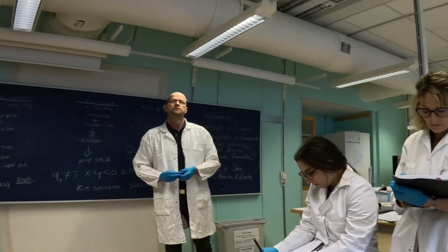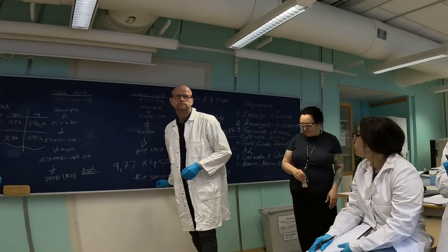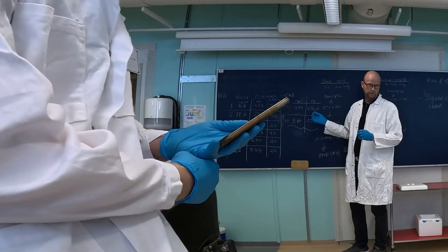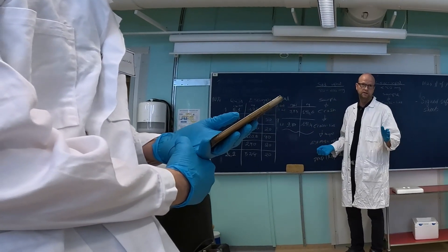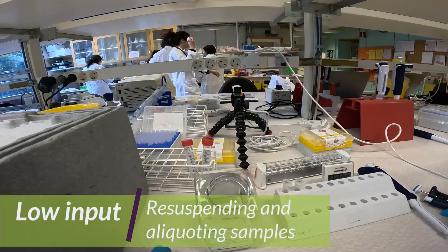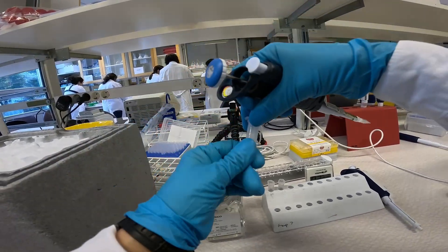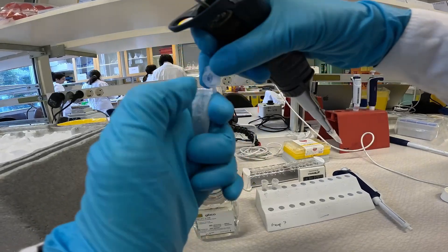It's more frequent that you underestimate than overestimate? No, it's not uncommon. Because I thought it was low input, I just made one tube. But now we can see that it's a lot. So from that 450 solution, we are taking roughly half of the volume and continuing with that in the prep. Now I'm going to add the 450 to the low input tubes to make the reconstruction, and then we are going to take half of the volume, pellet again, and start the lysis with that.